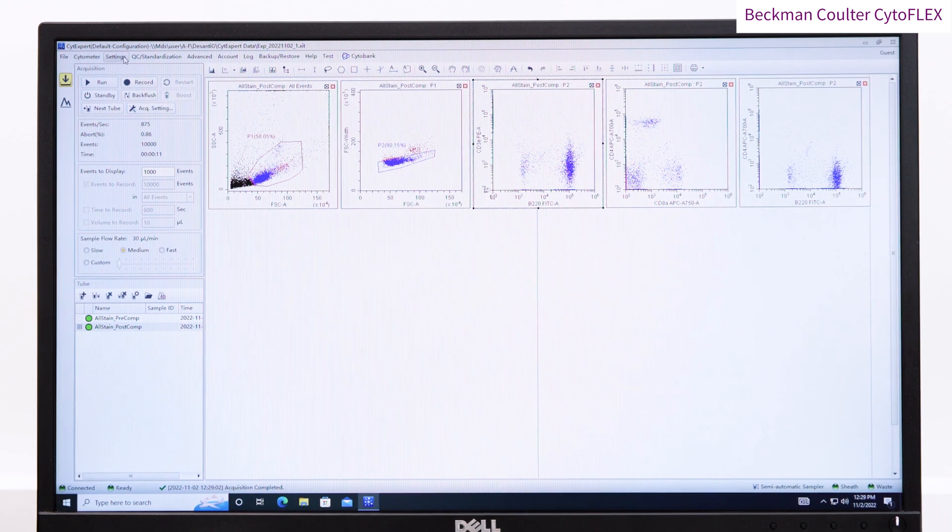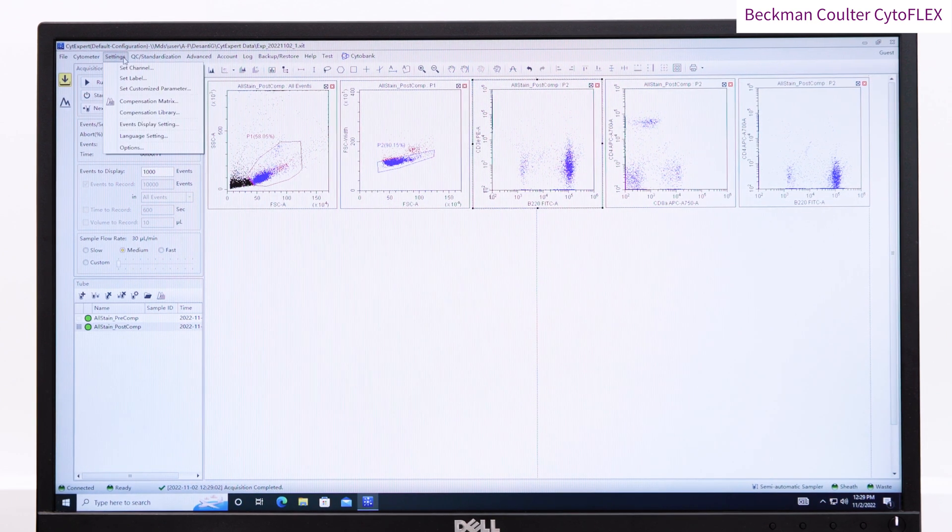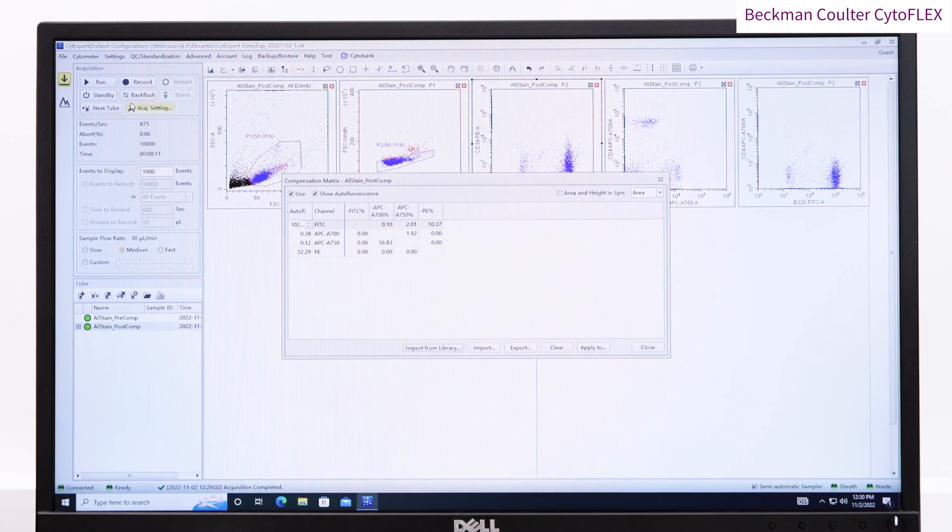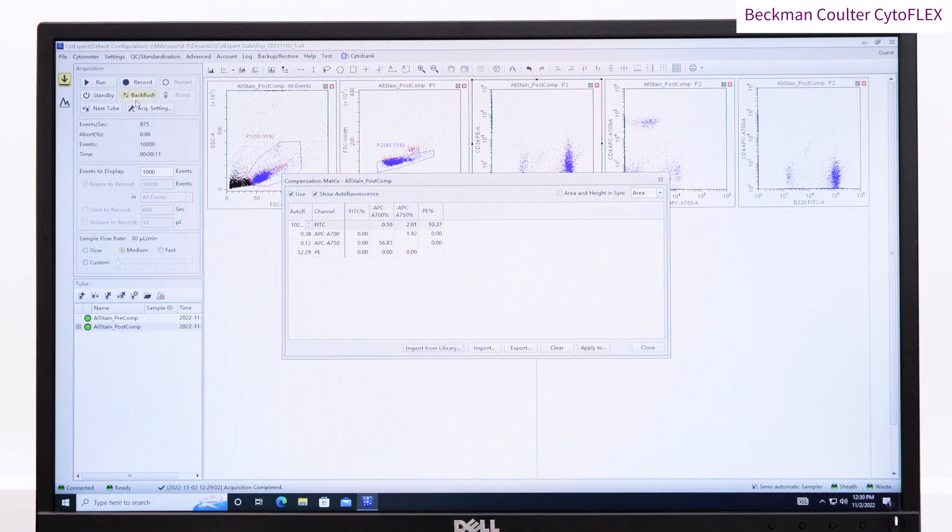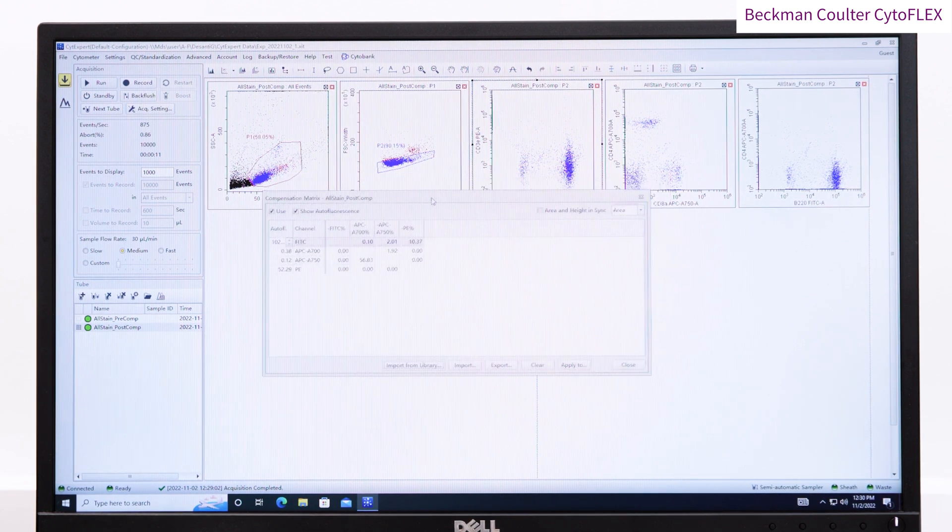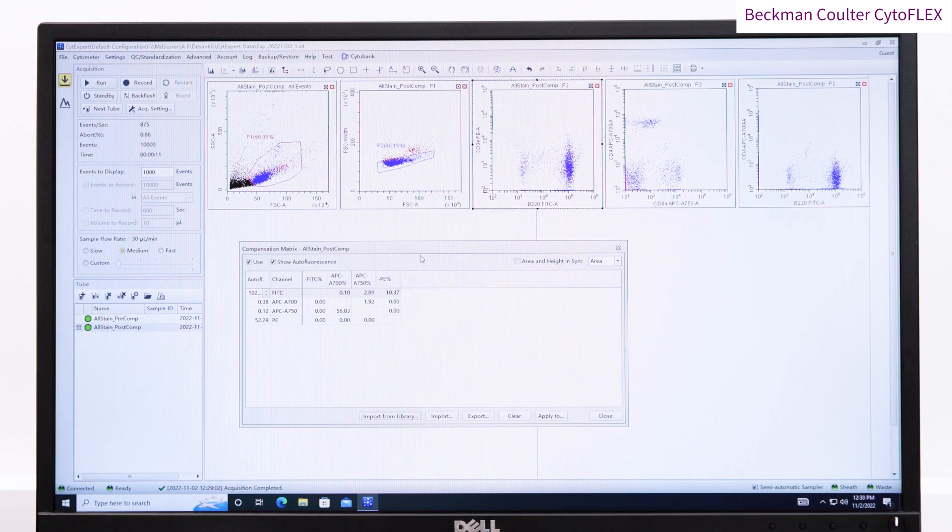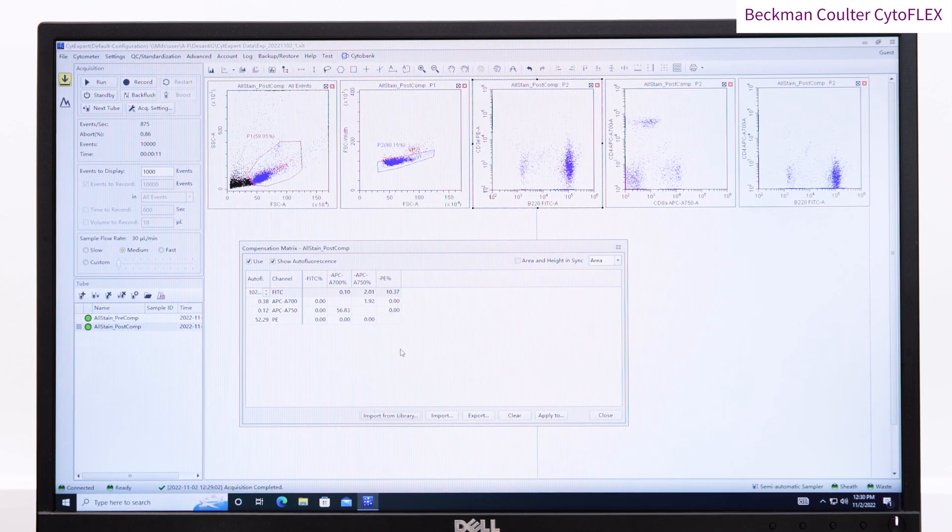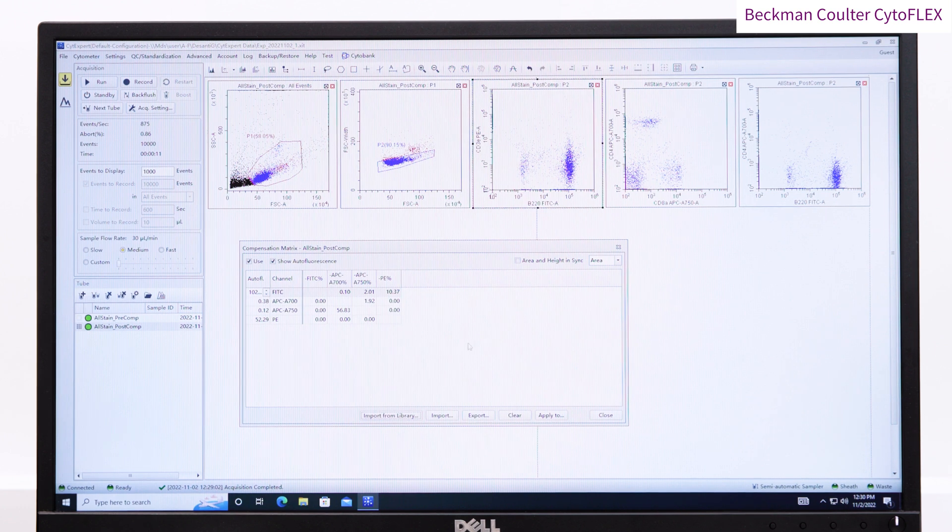To apply a manual change to the compensation, open the compensation window. Here we can see that the PE spilling to FITC has been overcorrected at 10.37%.